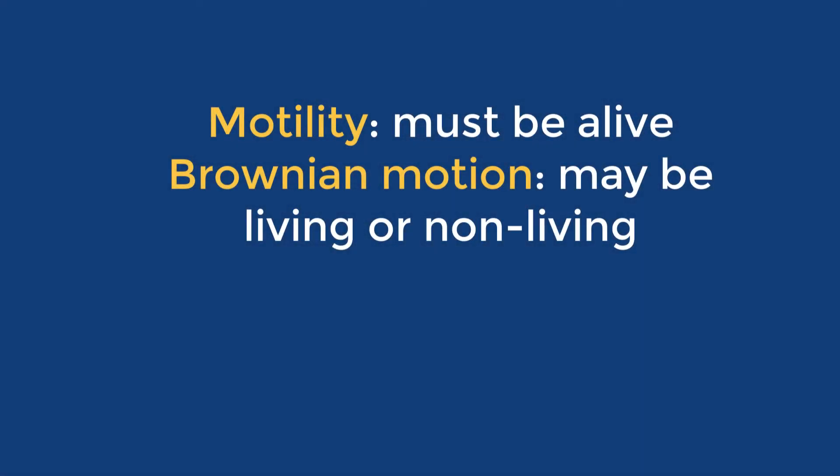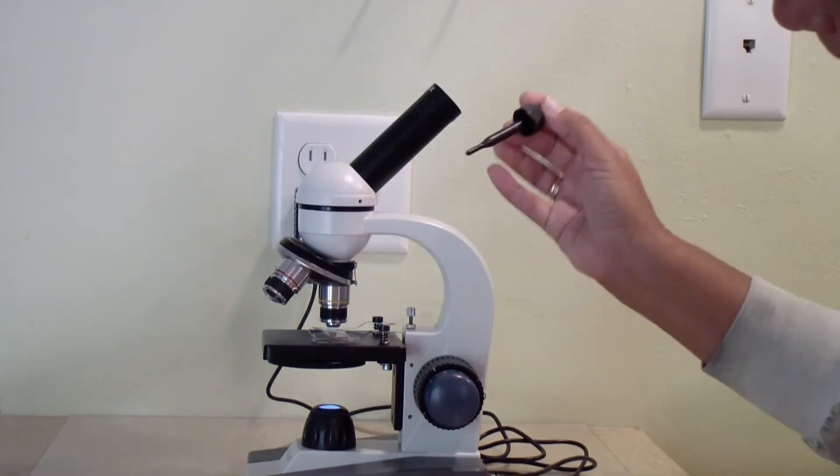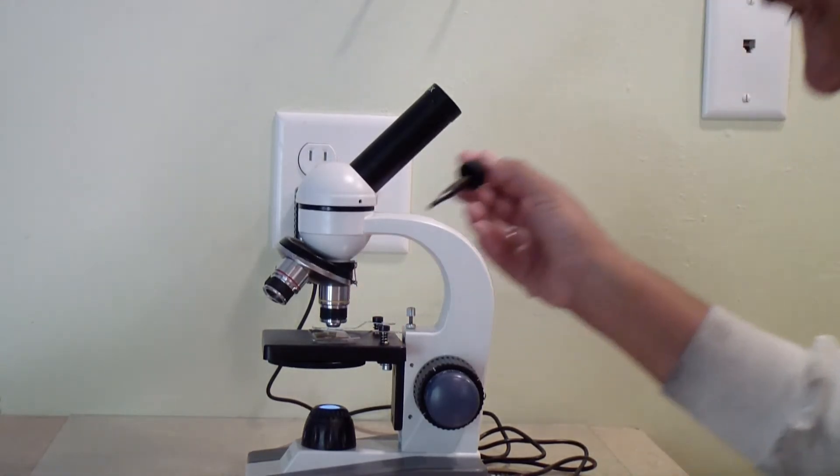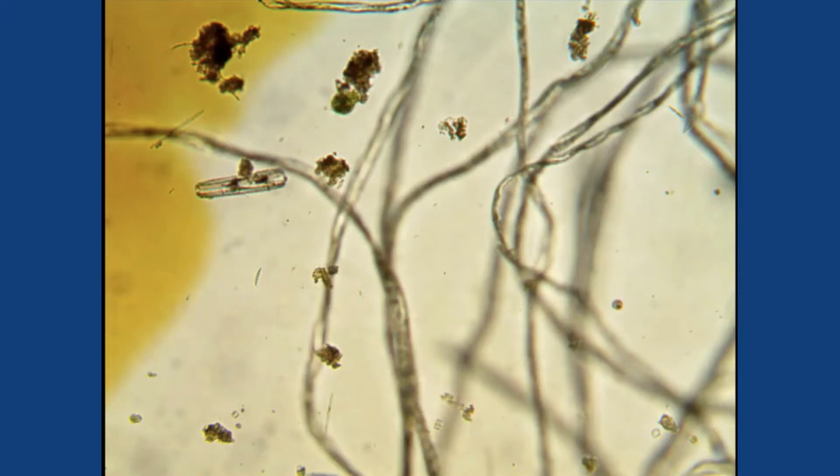There is a way to find out. True motility can only be performed by living organisms. If you see something moving, you may add a drop of iodine right along the edge of the coverslip.